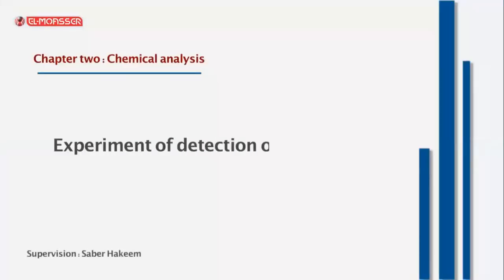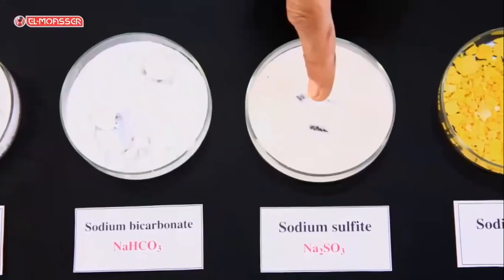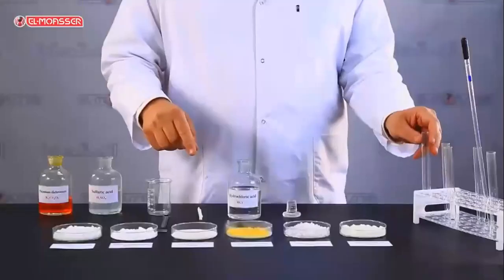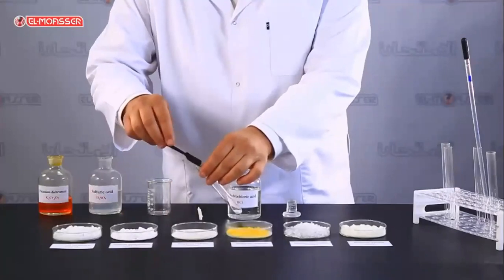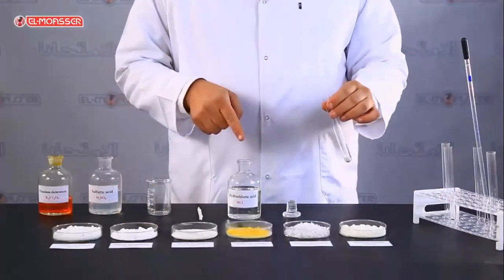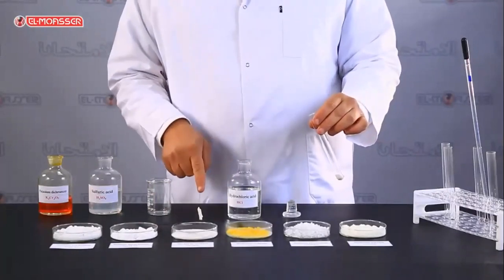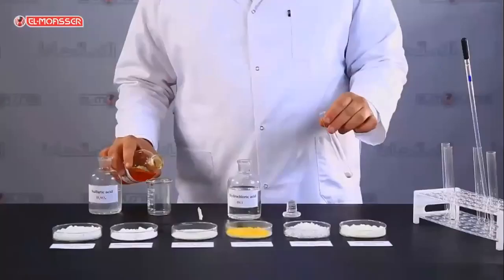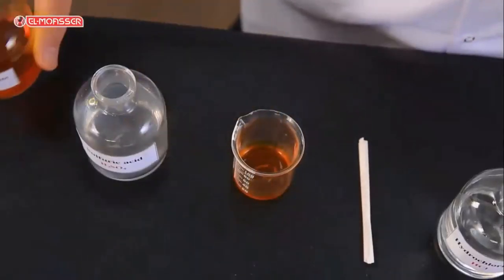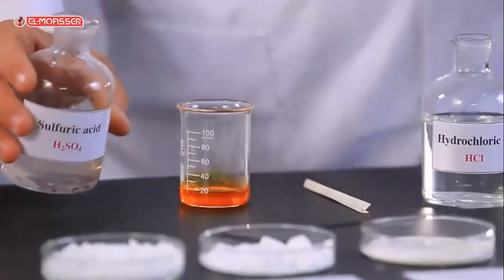Experiment of detection of sulfite anion. Sulfite anion is detected in sodium sulfite salt by a main experiment and another confirmatory experiment. Main experiment. Before starting the main experiment, we must prepare a paper wetted by acidified potassium dichromate using a concentrated sulfuric acid.